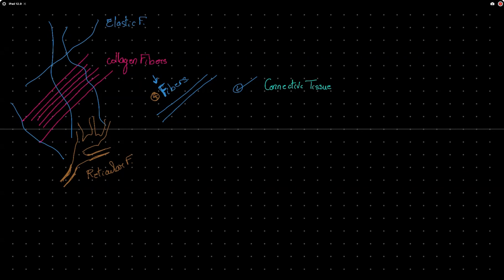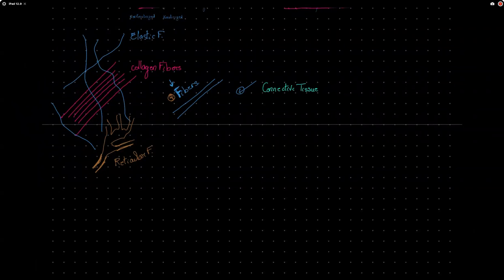There are two types of connective tissues that do not have clear fibers in them for us to say that this is a type of connective tissue once we looked at, but thankfully they do have very characteristic shapes. So all of the different connective tissues that we've seen did have some connective tissue fibers, but remember, we've got two of them that didn't show much fibers in their structure. We couldn't see those fibers. In my opinion, those are the blood tissue, which is a type of connective tissues.